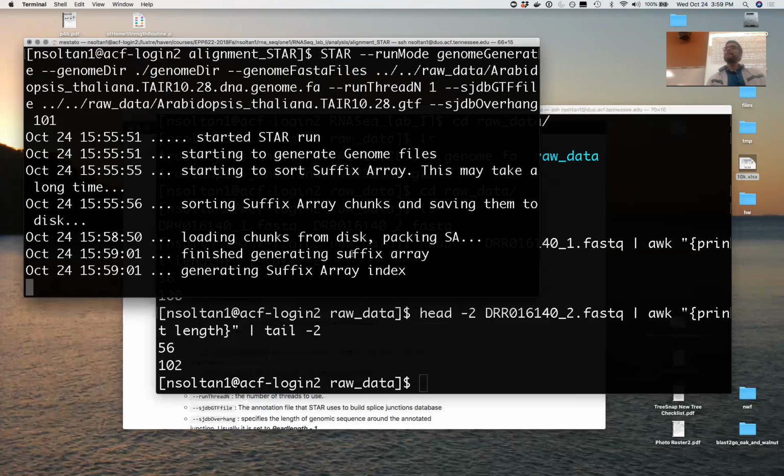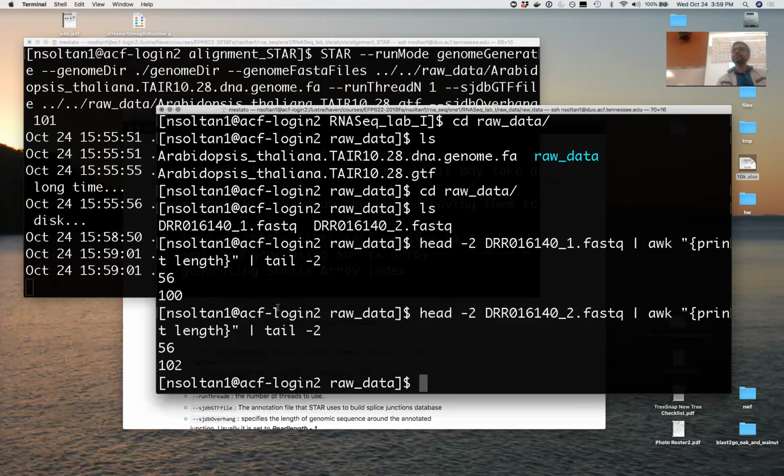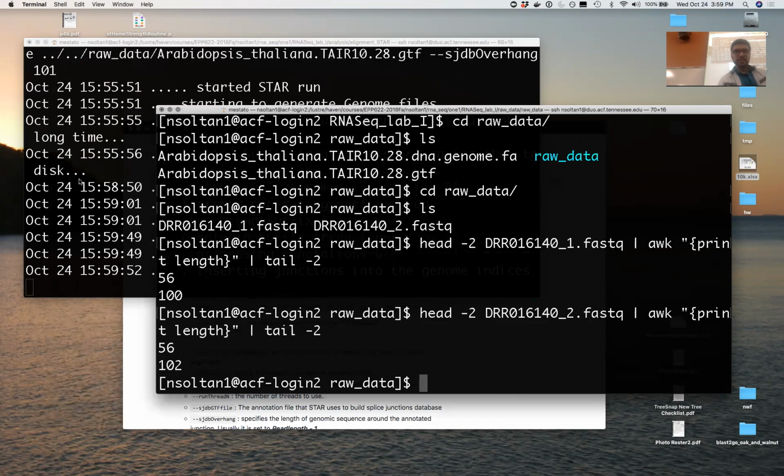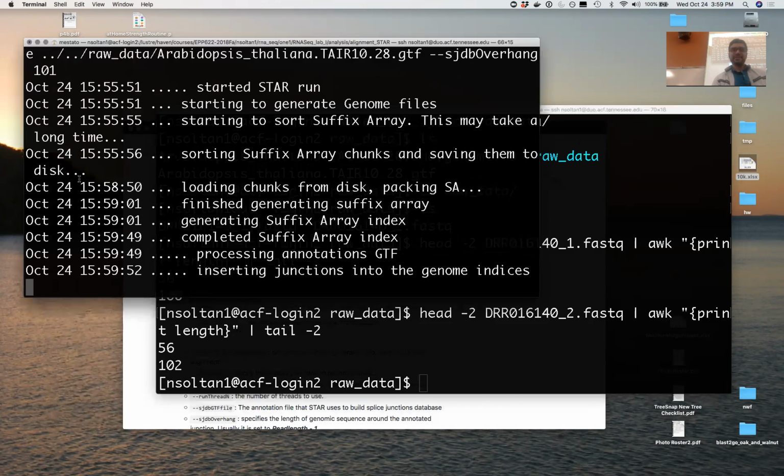You can also just paste a read into something like Word and count the number of characters. There are character counters on the internet where you can just paste a read and it'll tell you how many characters. Yeah, that's also good. This is a nice fancy way to do it, but if you're not going to remember it, because I don't ever remember how to type it.